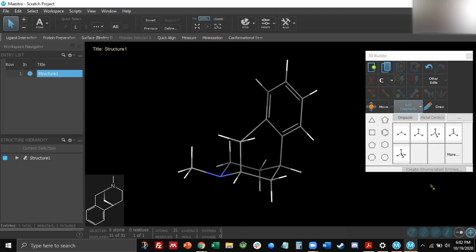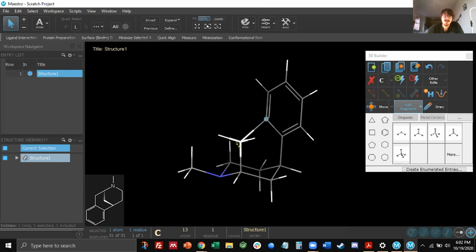Could you repeat how you selected 2 atoms at the same time? Exactly. Are you on Mac or PC? I'm on a Mac. Okay. Try holding, I believe it's Command, and clicking on the atom on the phenyl ring and the axial carbon on your cyclohexane. Are both of them selected if you hold Command? Thank you. Okay, so it did work.